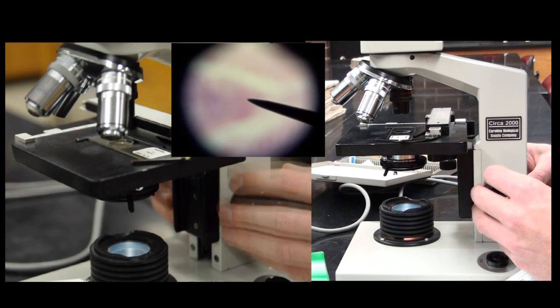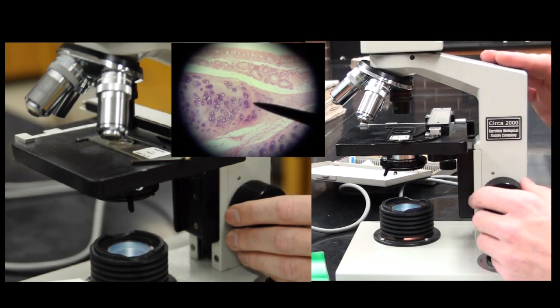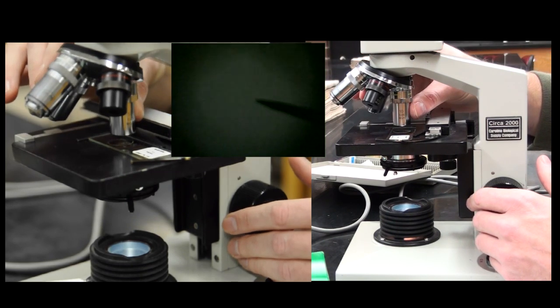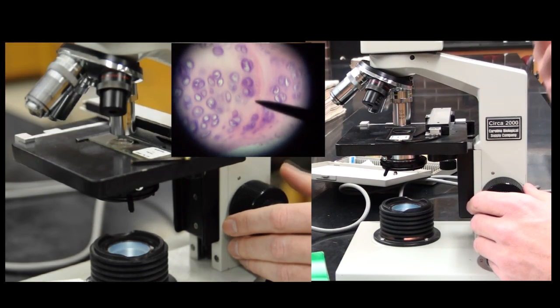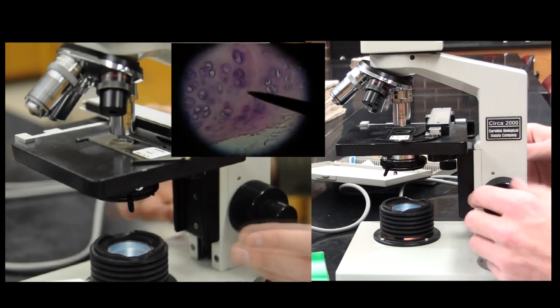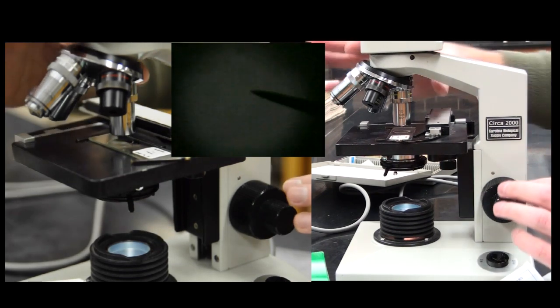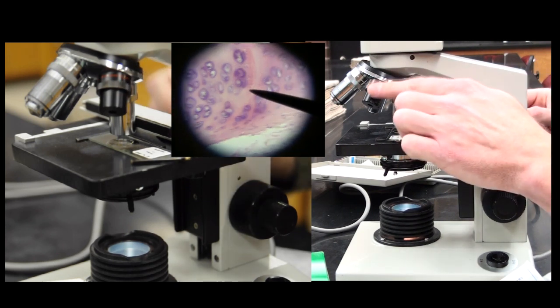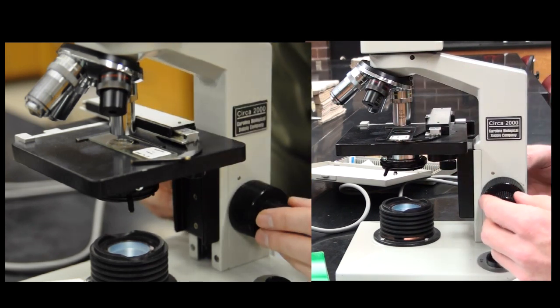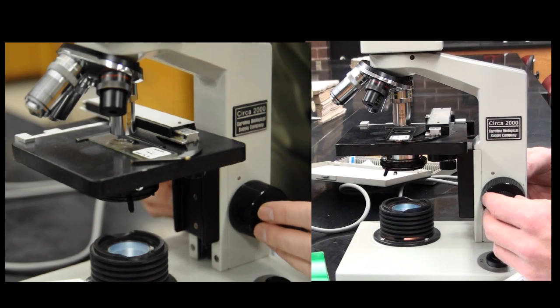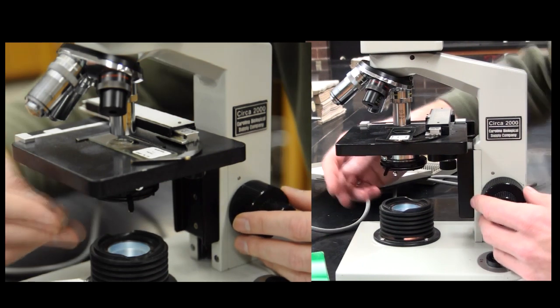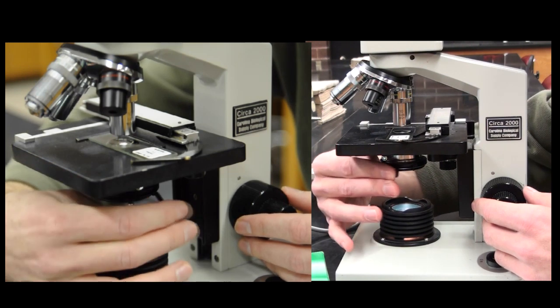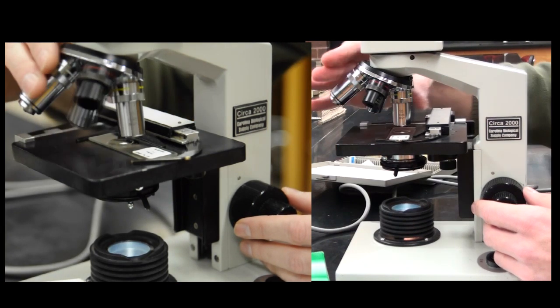Once I'm in focus, most of these microscopes are what I call parafocal. As I move from one lens to the other, it should maintain its focus. There are going to be times where it goes off a little bit, but once I start moving to higher objective lenses, as long as I focus under a lower objective lens first, I can use my fine focus knob and focus my specimens. Based on how well I see it, I may want to adjust the amount of light as I go through.